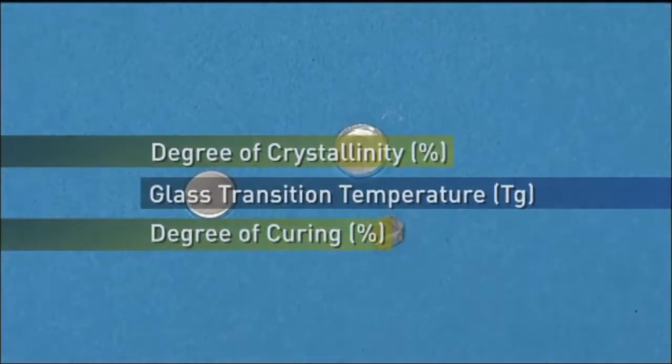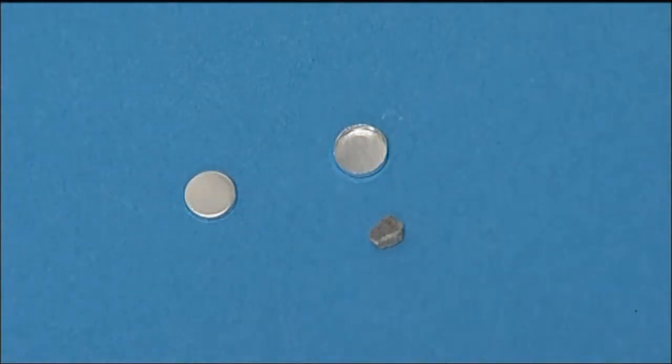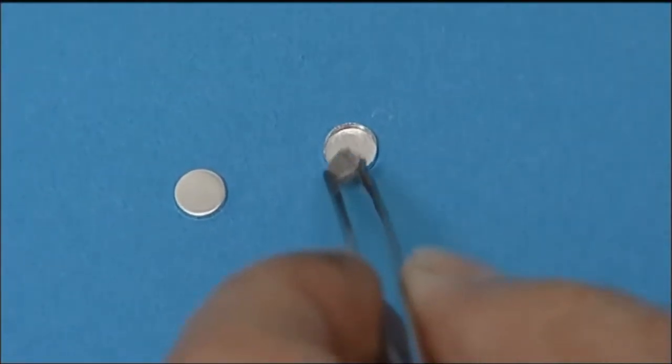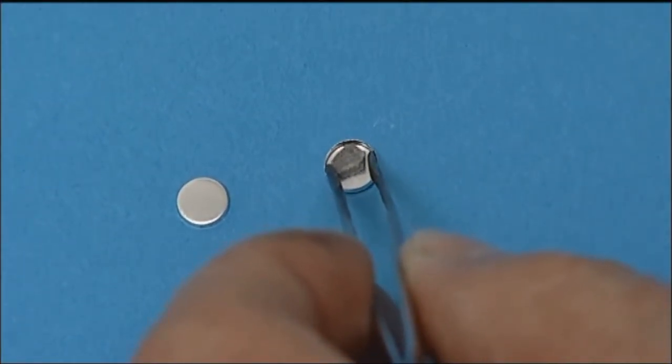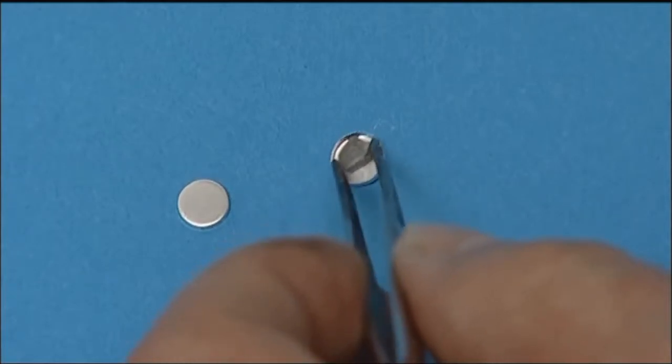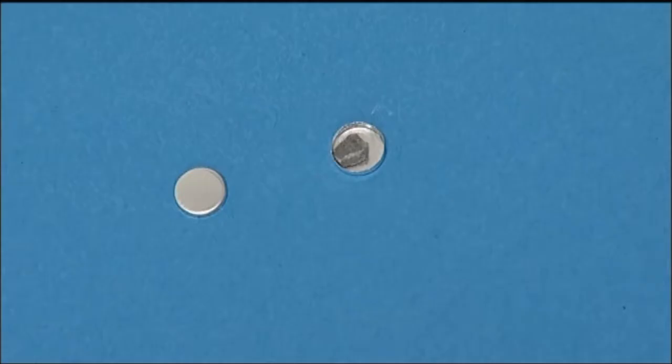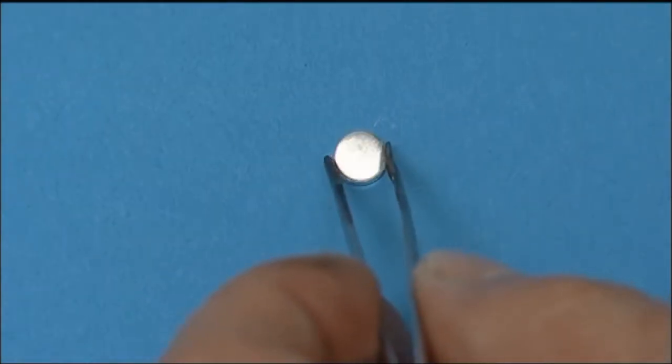This is the aluminum pan for the differential scanning calorimeter, able to measure the glass transition temperature and the degree of curing of the polymeric sample. Initially we put a small sample of 5 to 10 milligrams inside the aluminum pan, close and seal it off.